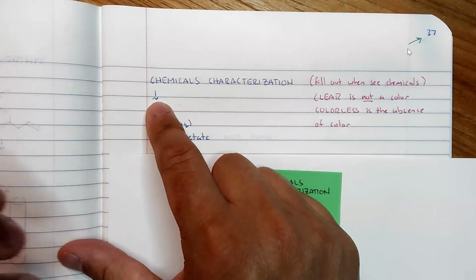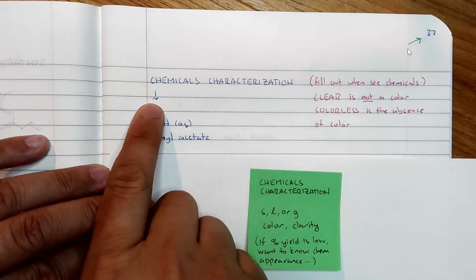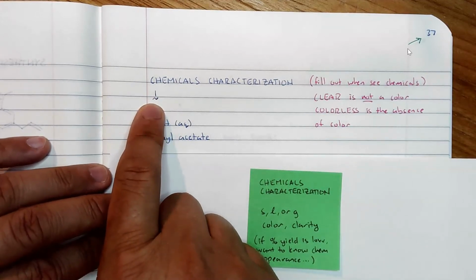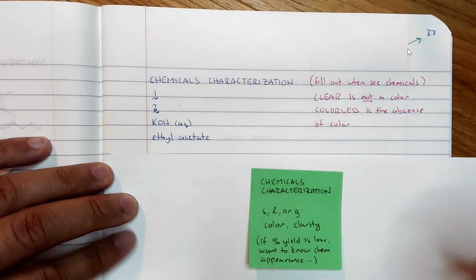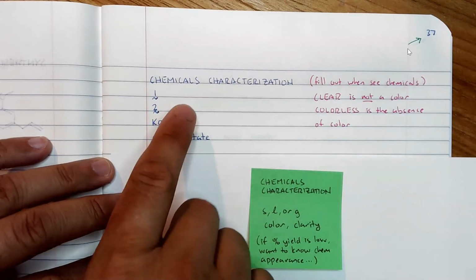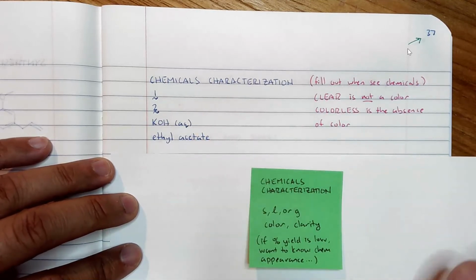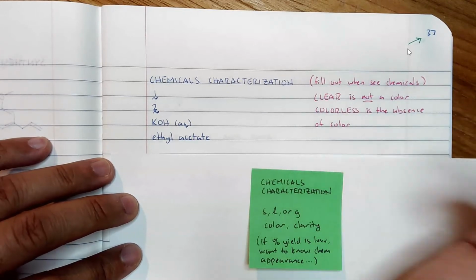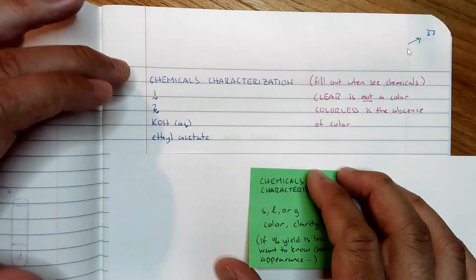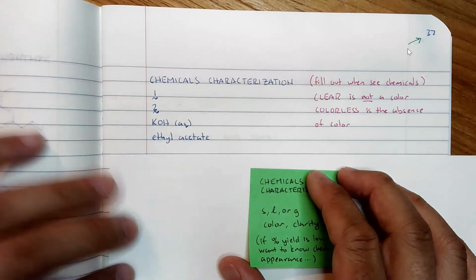But what if the percent yield was low? Then I could go back and say, maybe it wasn't that great that eugenol was that color. We don't know if it will work or not. We just want to make sure we get all the characterization so that if there was a problem at the end, we can try to identify what the problem area could be. It could actually be the starting material, degraded or impure.